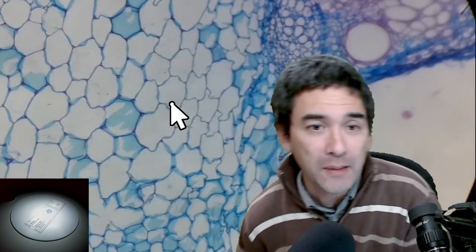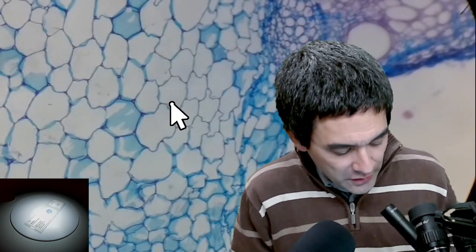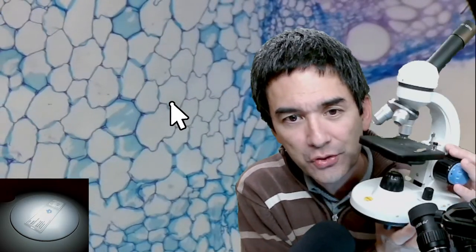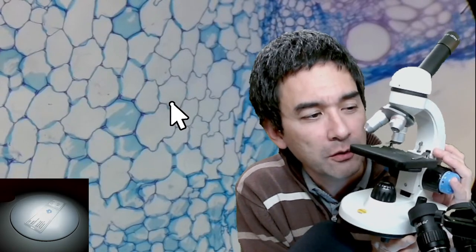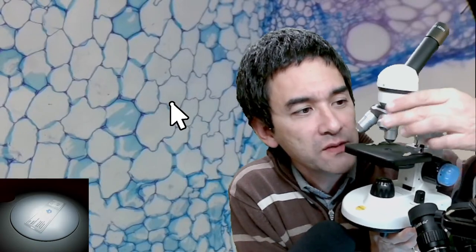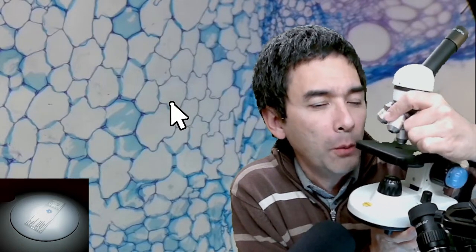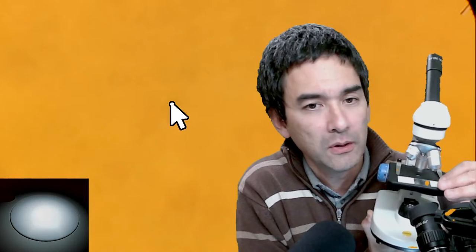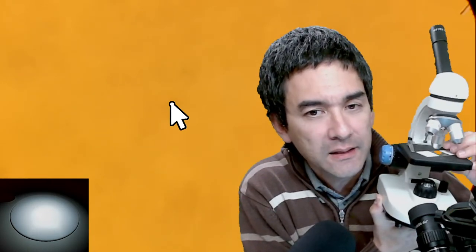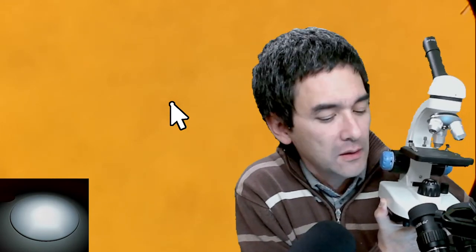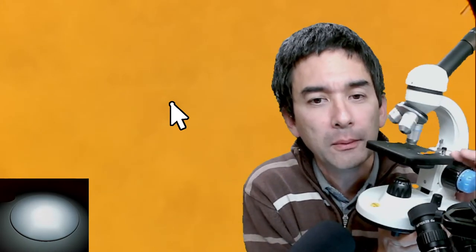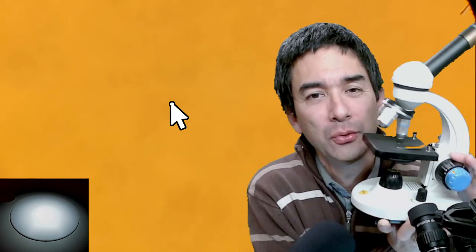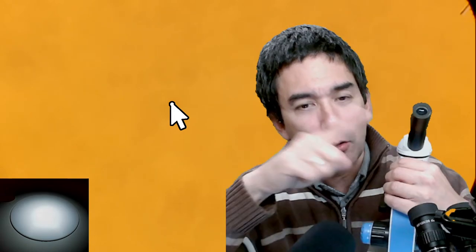Before looking at samples, let me show you some microscopes for orientation. This here is a small introductory compound microscope — what most people picture when they think of microscopes. It has objectives that you can rotate, an eyepiece to look through, and you put a slide on the stage. Light comes from the bottom. This is the most well-known type of light microscope.